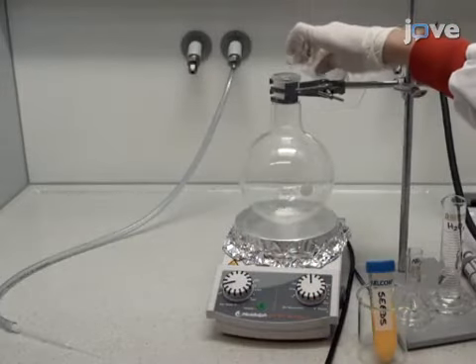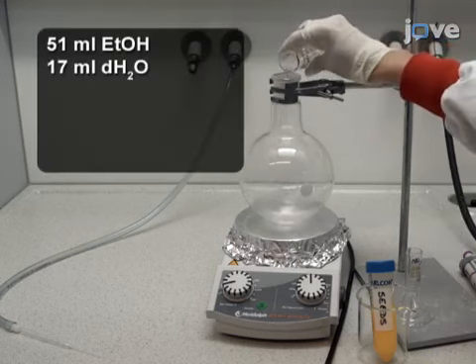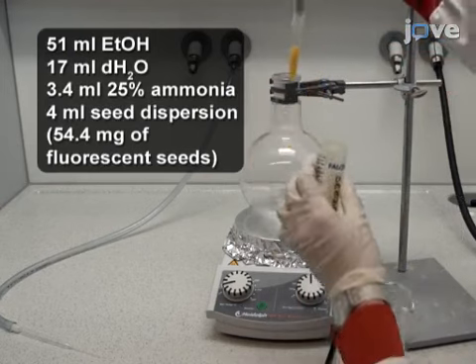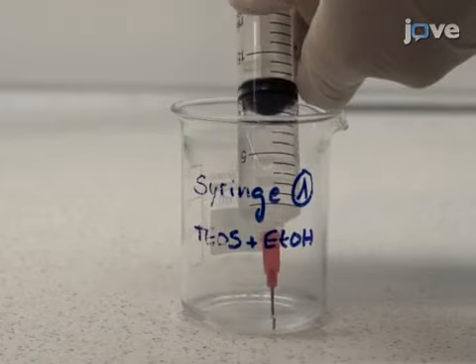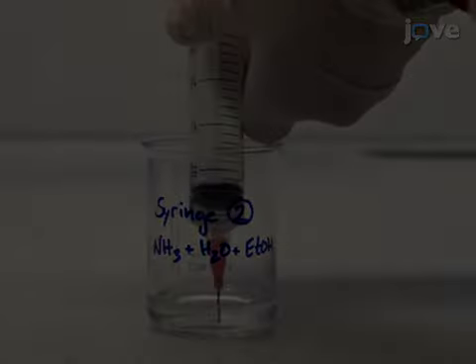To synthesize the core-shell silica particles, first add ethanol, deionized water, 25% ammonia, and the seed dispersion to a 1-liter round-bottom flask. Then, fill a plastic syringe with 5 milliliters of TEOS and 10 milliliters of ethanol. Fill a second plastic syringe with 1.34 milliliters.